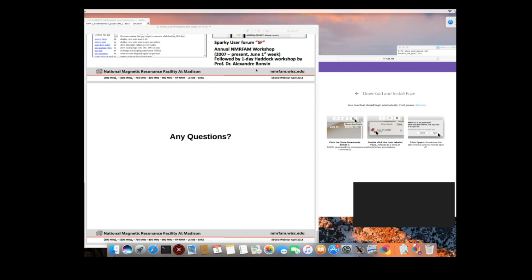The other conformation I just neglected, and selected the major ones to run the Pine, and then next to that, you can adjust. So the peak picking and making the peaks aligned is very important.